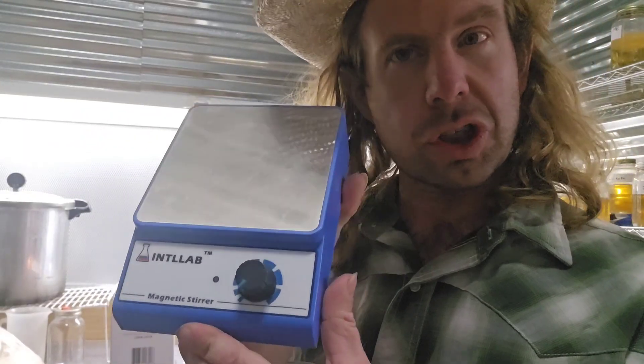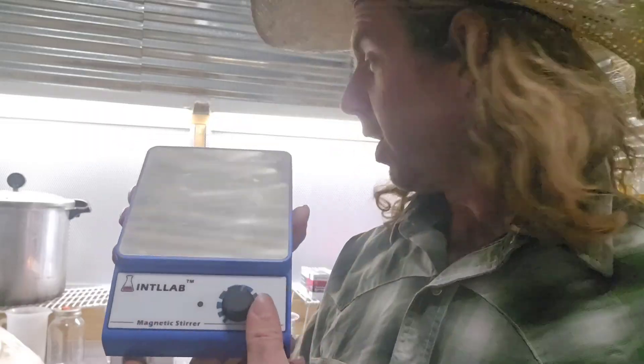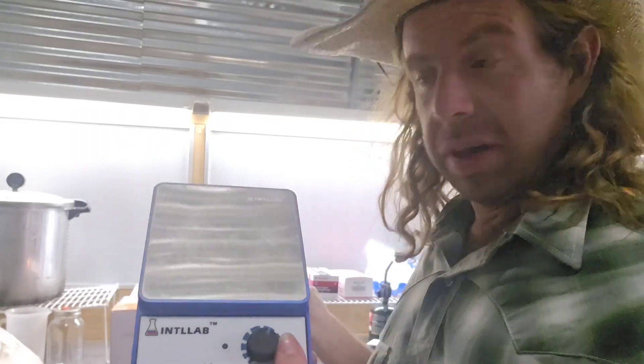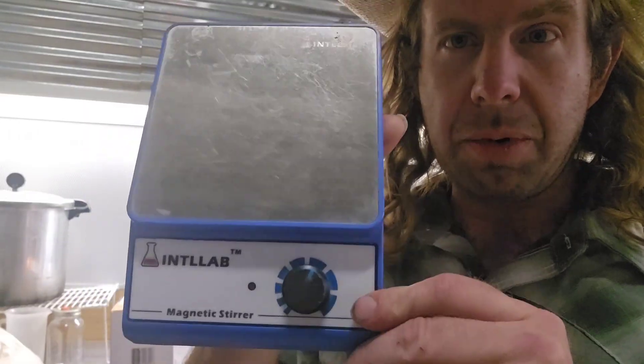Number eleven: a magnetic stirrer. When you have all that liquid culture you're going to need a magnetic stirrer to stir it up. You just turn this on, crank it up, and it's going to spin that little magnetic stir bar inside the liquid culture jar. You are definitely going to need a magnetic stirrer — number eleven.